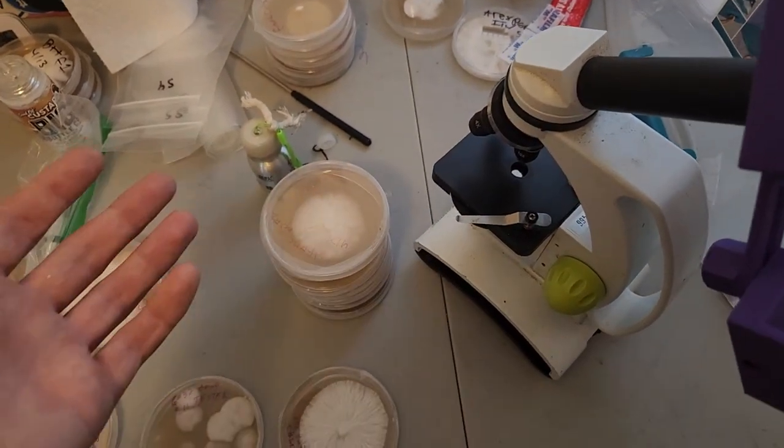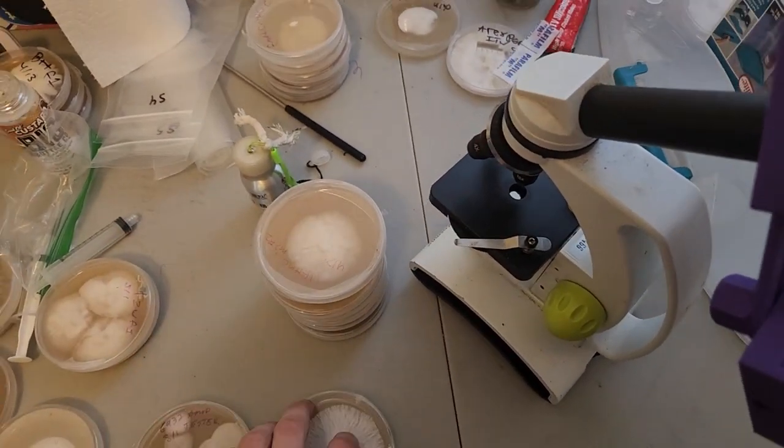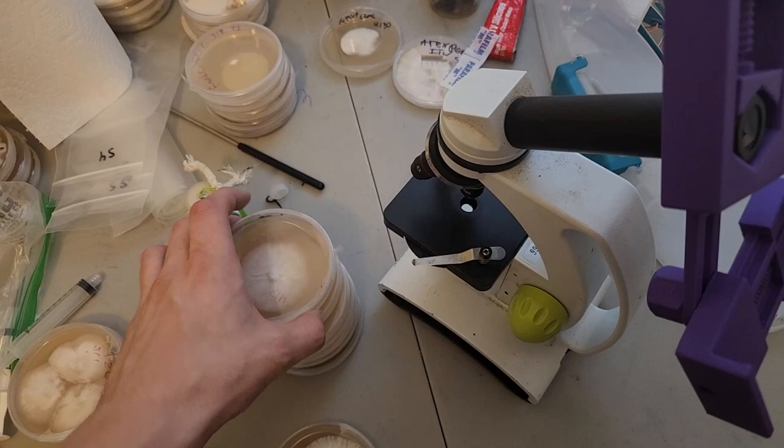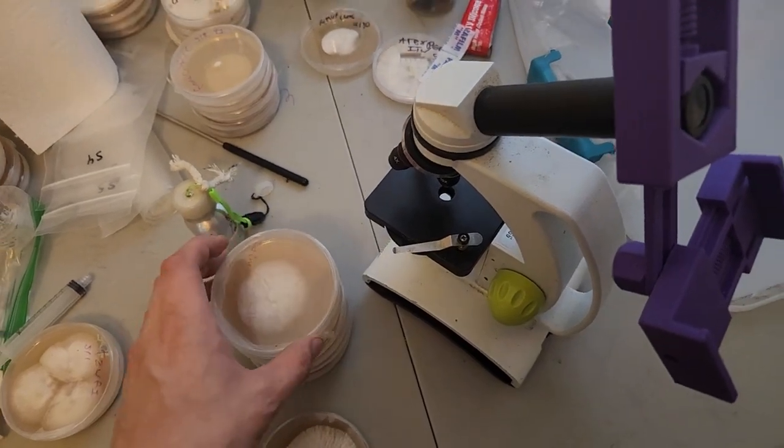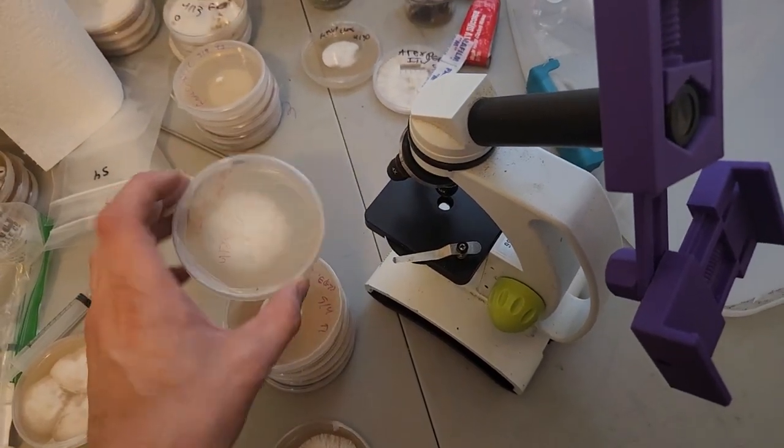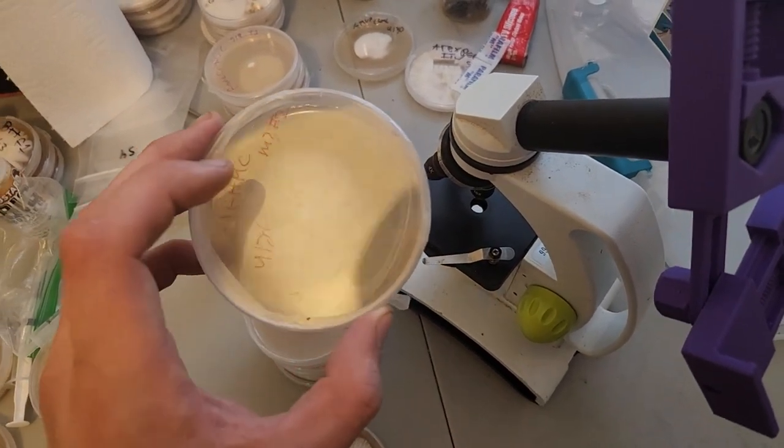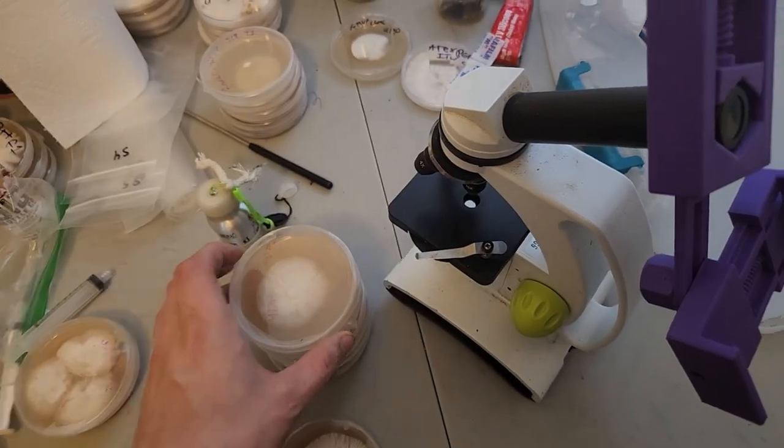I'll make a video more in depth on actually isolating single spores and different techniques, but this video is just going to be a quick one on how I check for clamp connections on the mycelium.